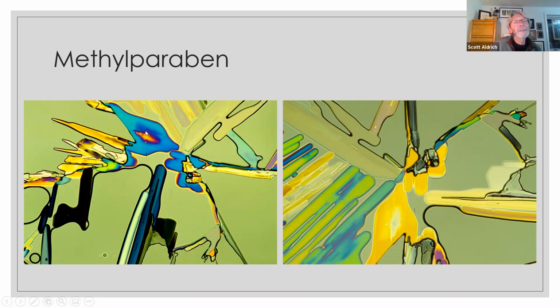And the solids give a structure and color mainly based on their thickness and orientation. Rotating this 90 degrees would show you pretty much the complementary colors. And the image on the right, same thing, different part of the field, and pretty exotic colors and structure. So a lot of fun.